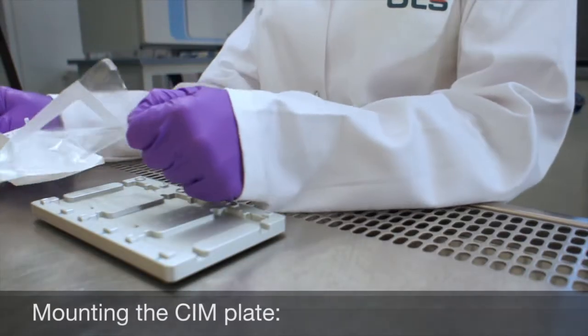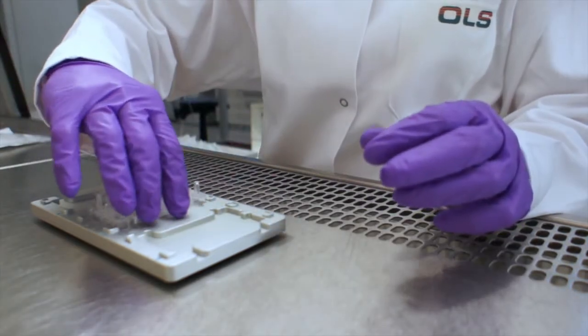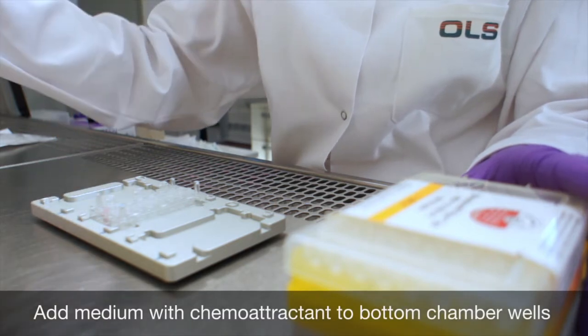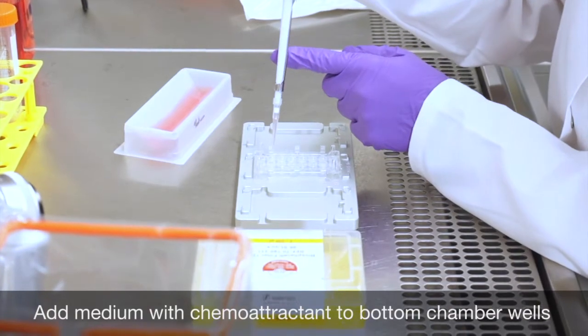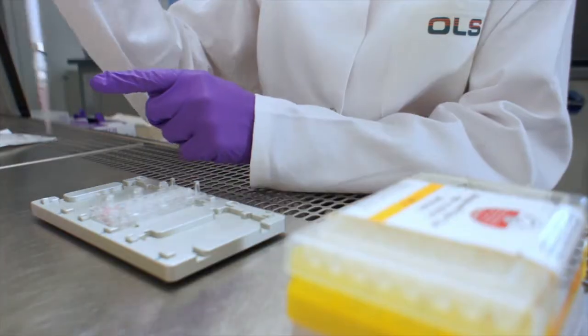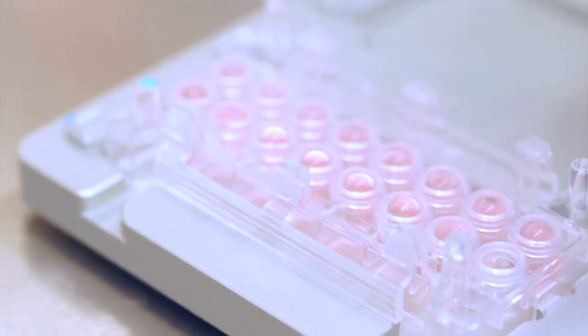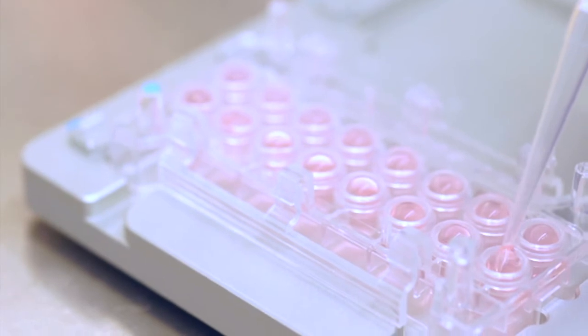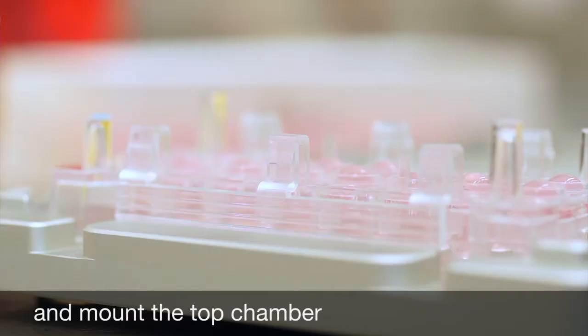To assemble the CIM-Plate, place the lower chamber on the assembly module and add medium containing the chemoattractant in each well. The liquid dome observed will ensure a proper seal without bubbles between the two chambers. Mount the upper chamber onto the lower chamber.